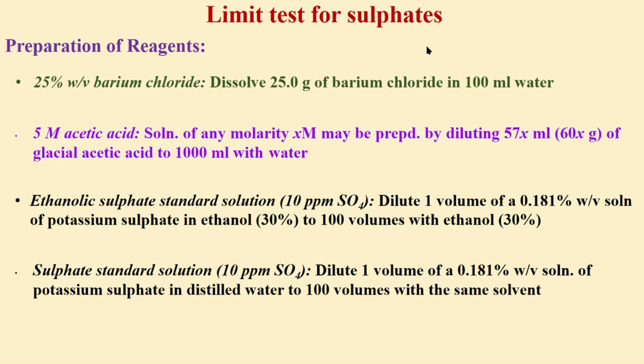This is how the limit test for sulfate is carried out.